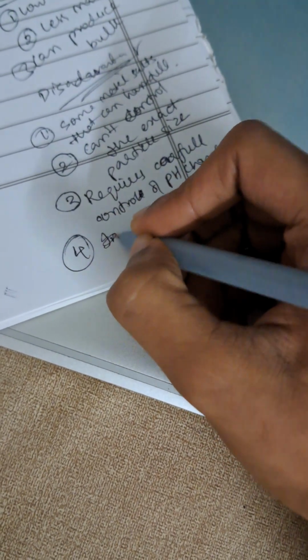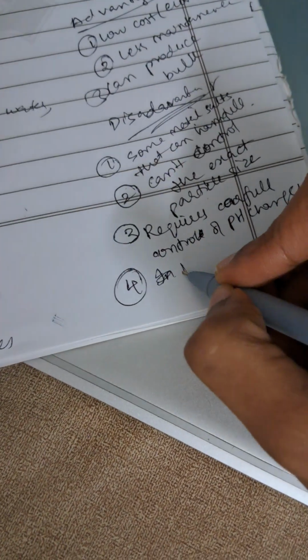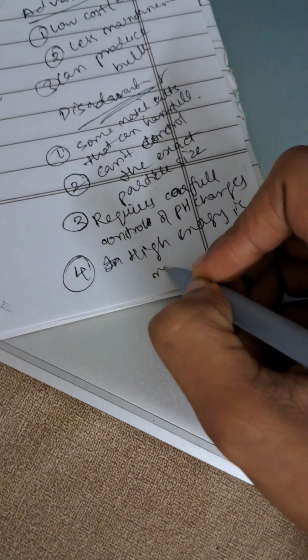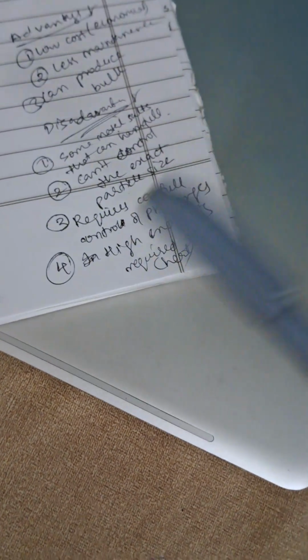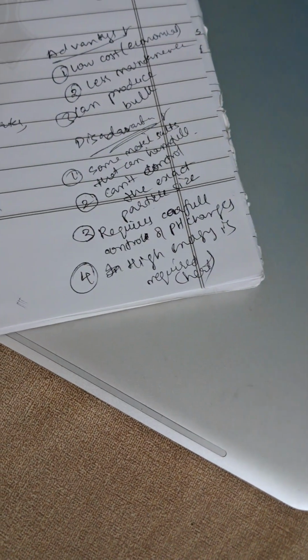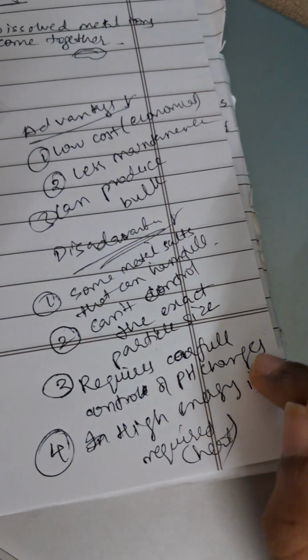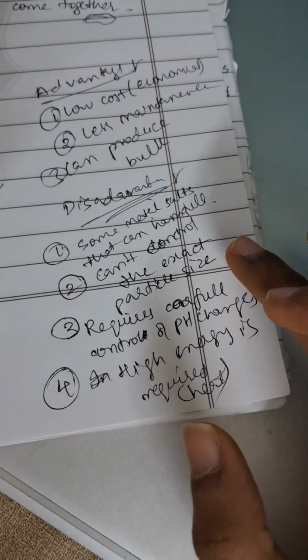Next, calcination. As calcination takes place, high energy is required, because you need to heat it, right? Heat energy is required, and as pH changes, it requires careful control over pH change. You need to observe carefully, and you can't control the exact particle size.